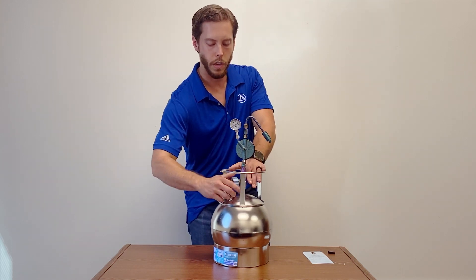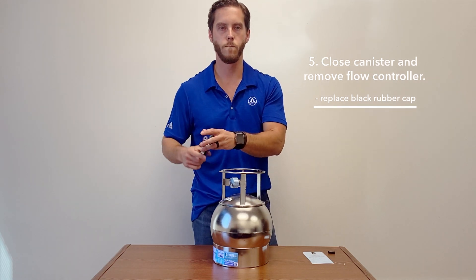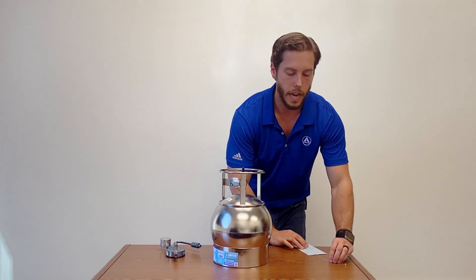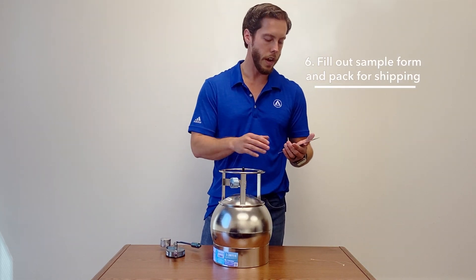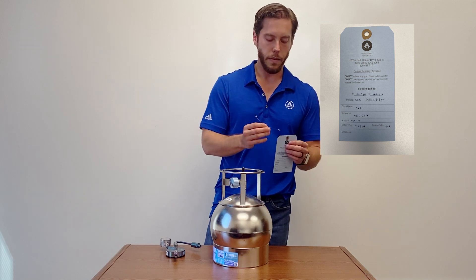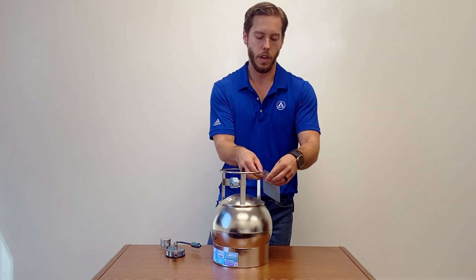At that point, you're going to close it off clockwise again. You're going to remove the flow controller and replace the black rubber cap — sample's trapped, it's good to go. You're going to fill out a blue tag which will come in the packaging in a folder. Fill out your initials, the date, the time you started sampling, and anything pertaining to the information that we need. It comes with a zip tie so you can attach it to the canister — real simple.